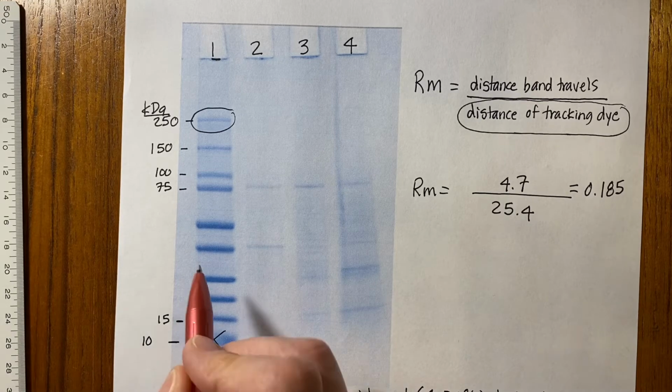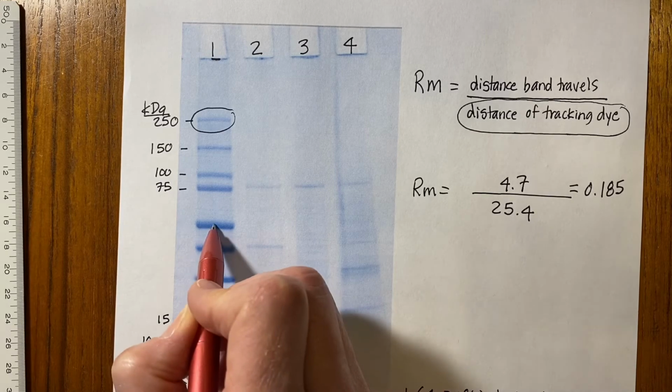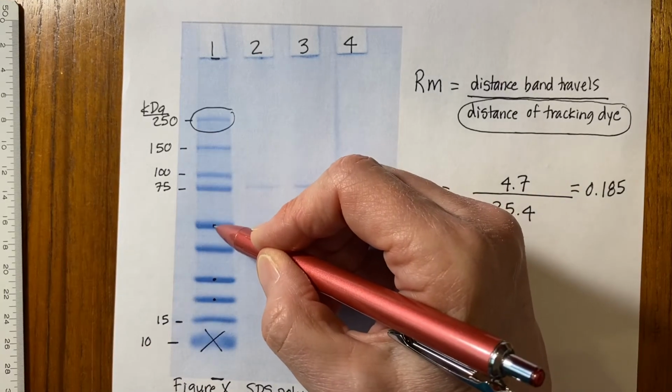And you want to measure to the middle of the bands. So if they're a little bit wide, pick the middle of the dark part. Don't do the top or the bottom of the band, do the middle.